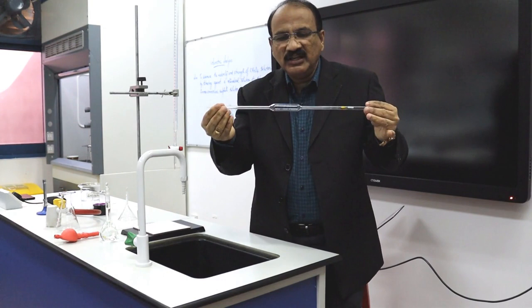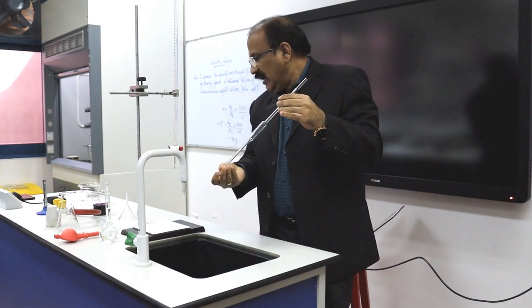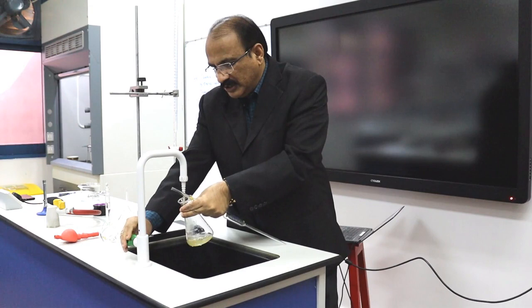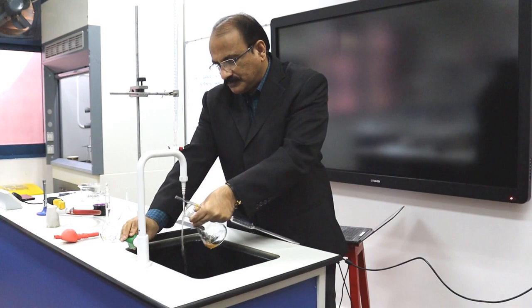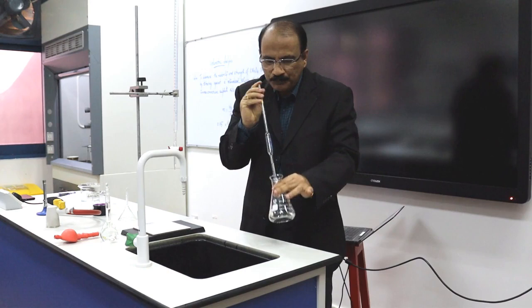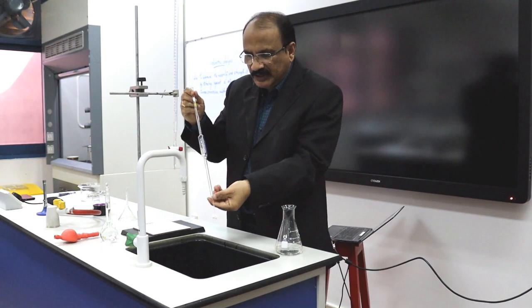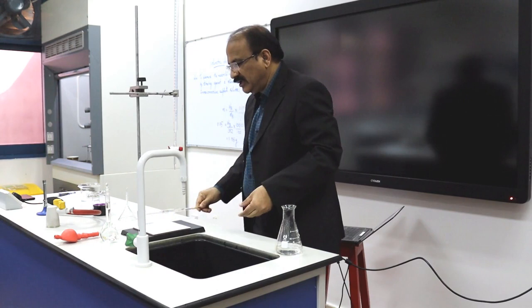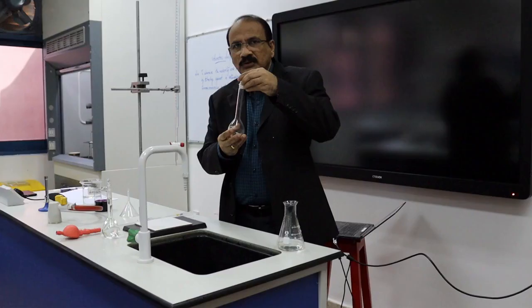The second apparatus is a pipette. The capacity of this pipette is 20 ml. For washing the pipette, collect a little bit of water in the conical flask. This is the way to wash the pipette. Drain it into the sink. Keep the pipette in such a way that it will not be disturbed.